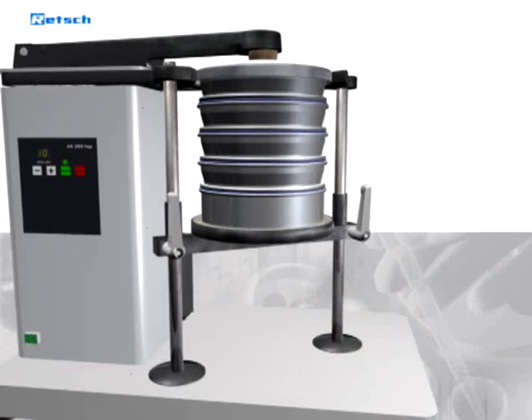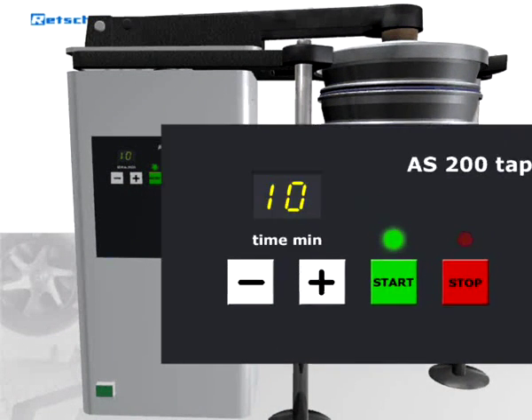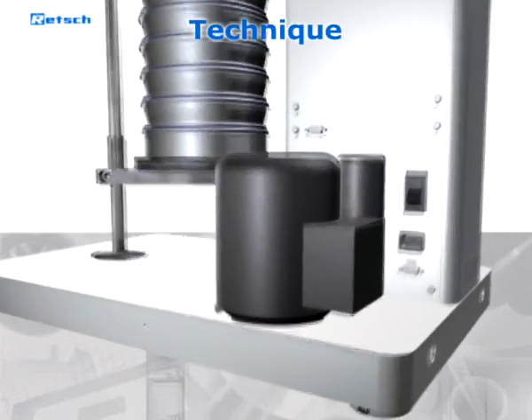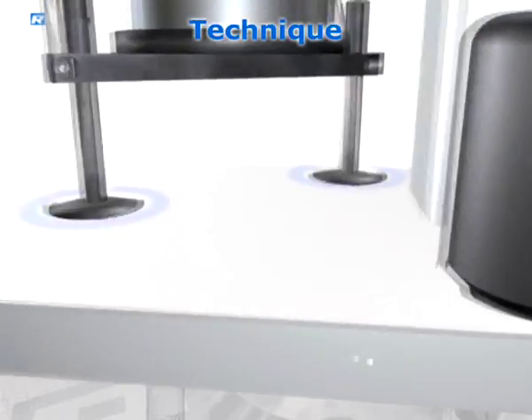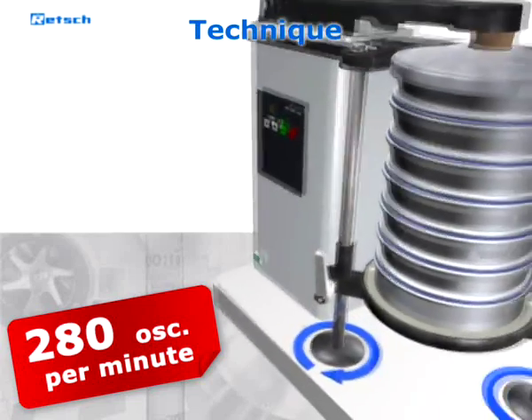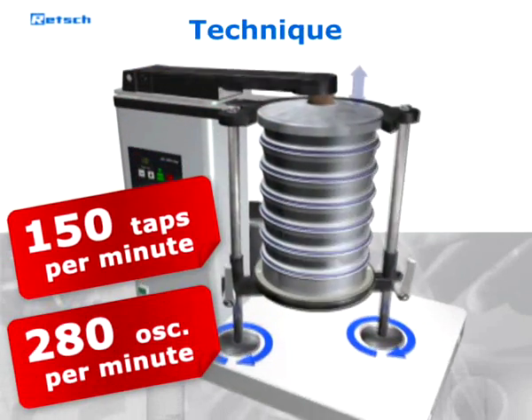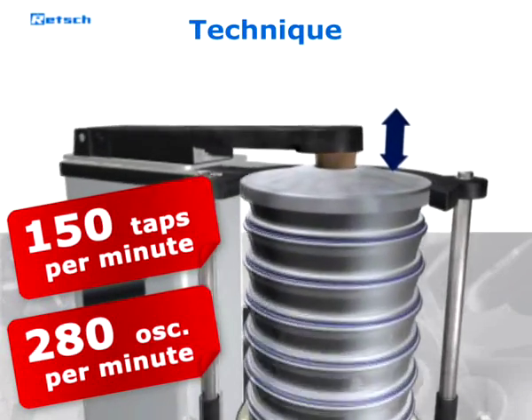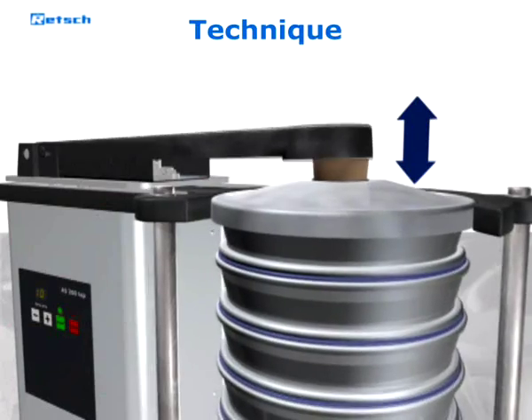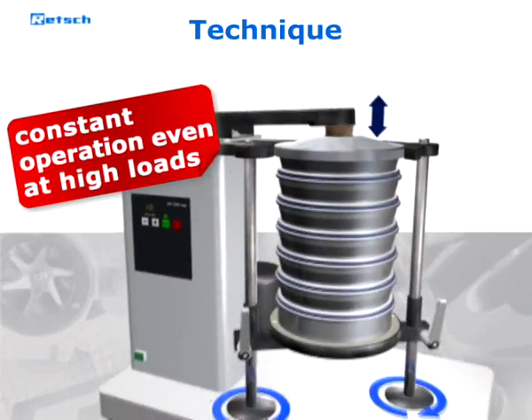The sieving time is set and the machine is started via a clearly structured keypad. When sieving has been started, a powerful drive makes the sieve plate perform horizontal circular movements with 280 oscillations per minute. To support the separation process, 150 taps per minute are transmitted via the cover to the sieve stack. The number of oscillations as well as the number of taps are determined by a mechanical gear which keeps them constant even when sieving high loads.